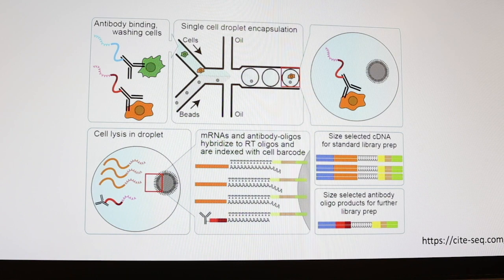So this is just a schematic, but it's essentially the same as single cell RNA-Seq. This is the main step that differs, and it's analogous to a very simple staining you would do for flow cytometry. And then when you do library prep, the transcriptional data and the ADTs actually end up in different libraries, which is also an advantage if you need to manipulate these differently.